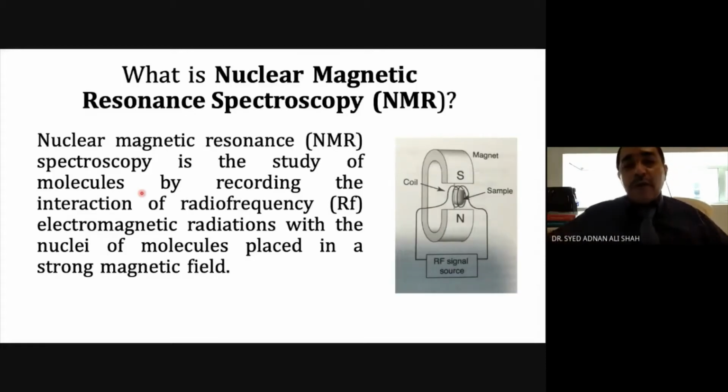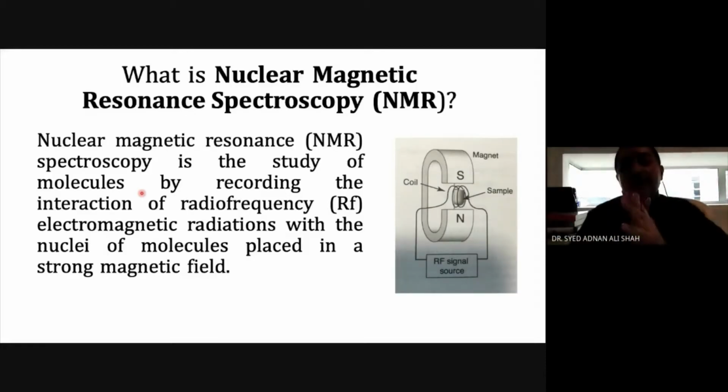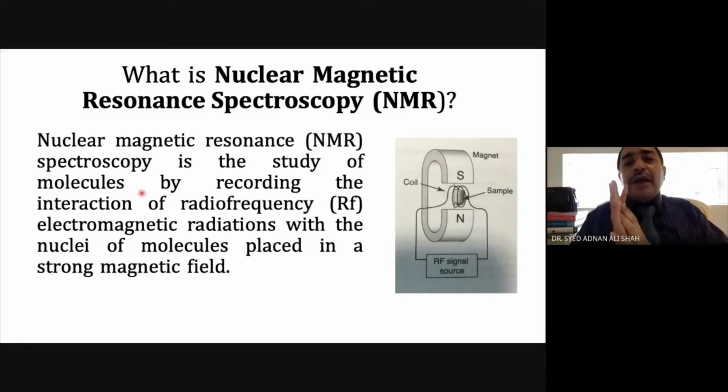So first of all, I will give just a very, very brief introduction of nuclear magnetic resonance spectroscopy. I will not go into the detail of instrumentation. I will not go into the depth of the science of nuclear magnetic resonance spectroscopy. Just an overview of what this instrument is and how it works.